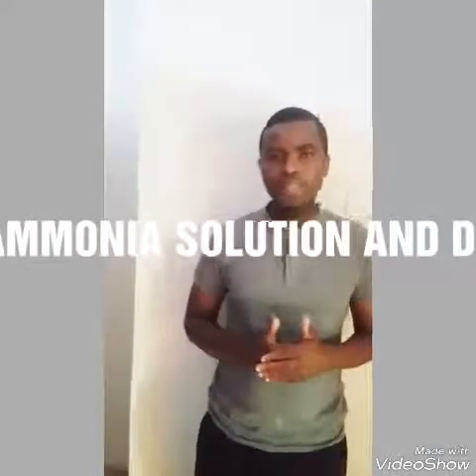In today's video, we are going to discuss testing for cations. You are required to test certain cations such as zinc 2 ions, aluminium 3 ions, copper 2 ions, iron 2 ions, iron 3 ions in the exam. Most of the time, we normally use two reagents: one of them is dilute sodium hydroxide and the other is aqueous ammonia. You are expected to observe the result and identify the different cations.